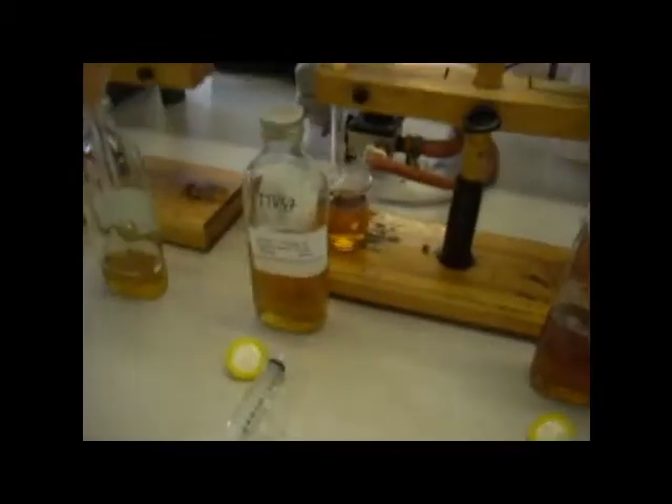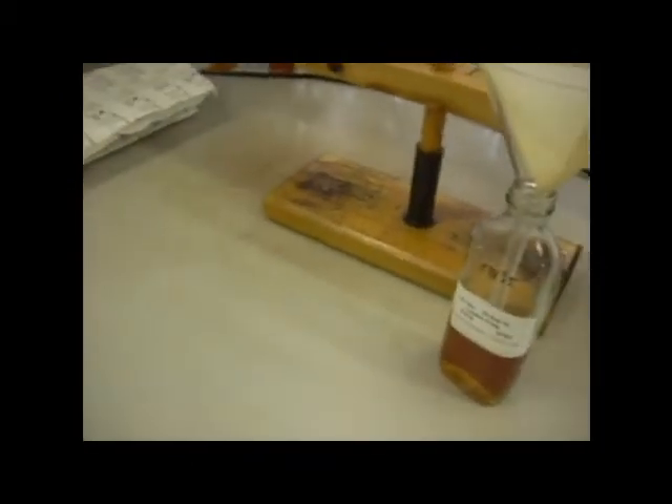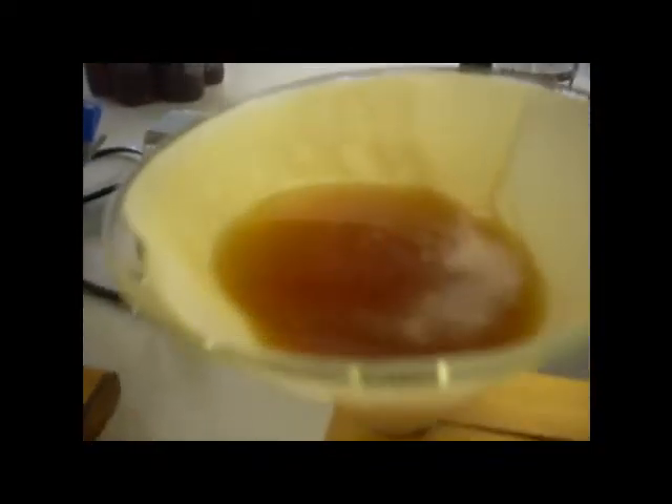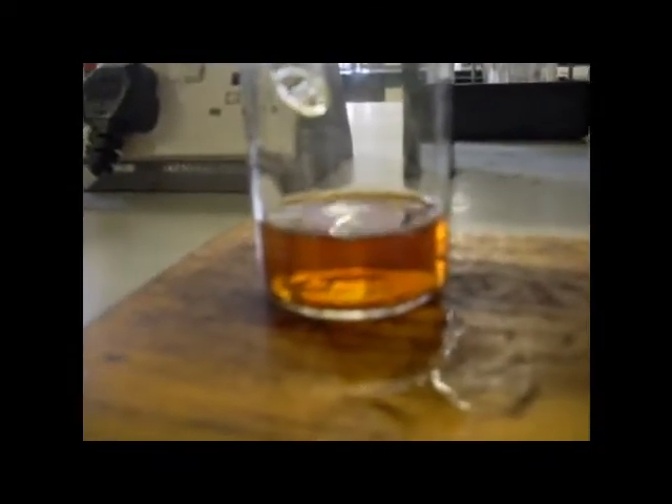Right now I'm working in the lab at Fuller's and we're working through a few different beers, checking the color of the beer, the alcohol, the original gravity, the present gravity, and the pH. Here we're filtering beer which is originally a bit cloudy and running it through a fine mesh into clear beer.